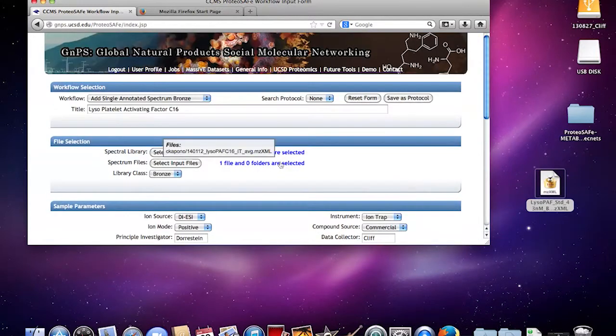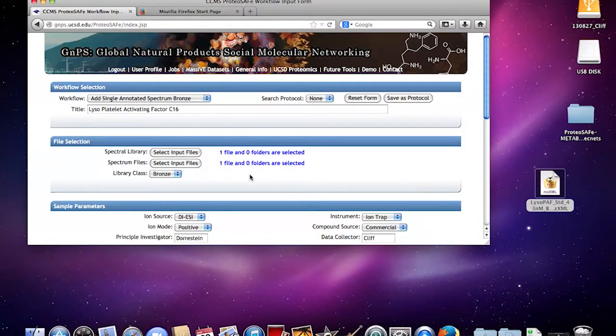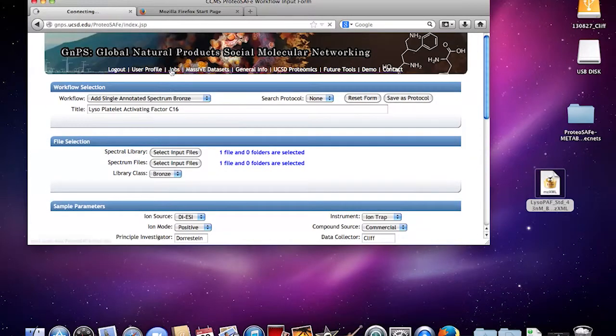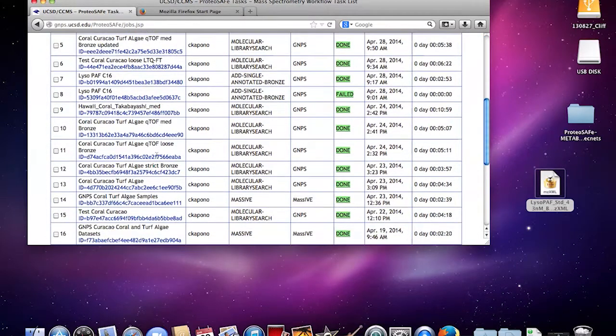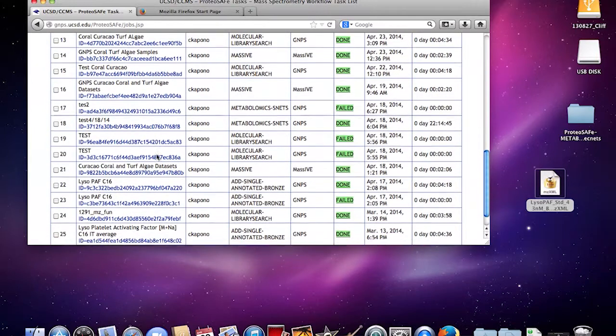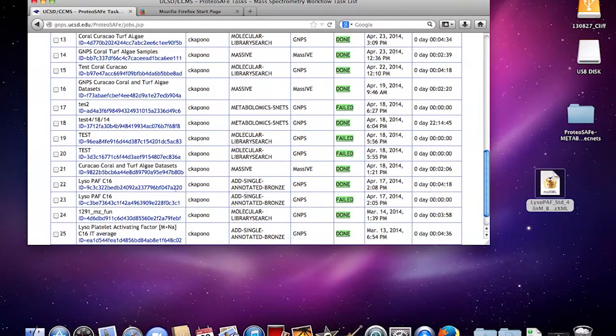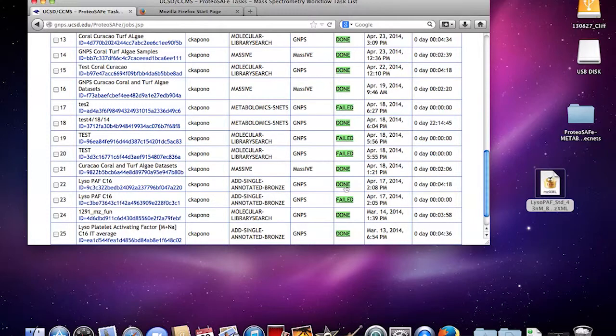Then you just submit it. Once you submit it, it should be uploaded into the library. This should be in here, so it should say single annotated bronze completed.